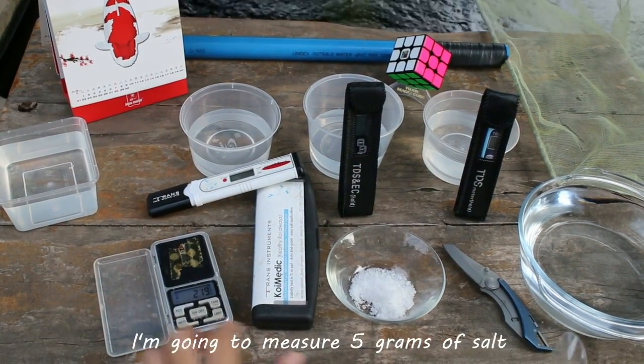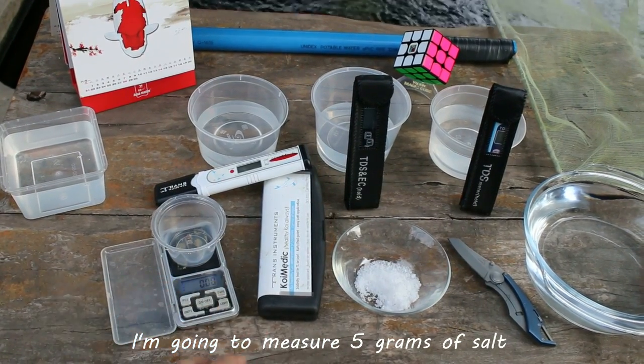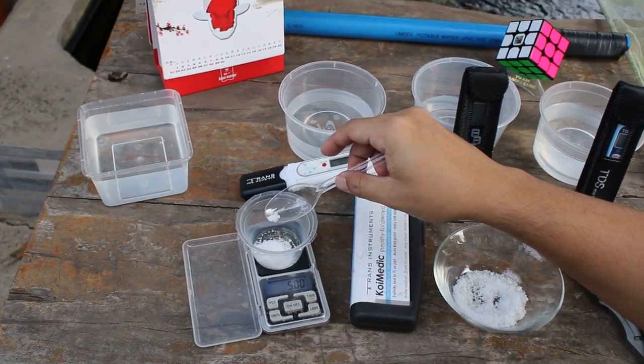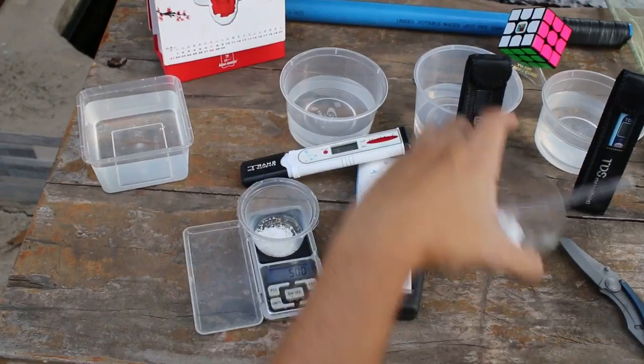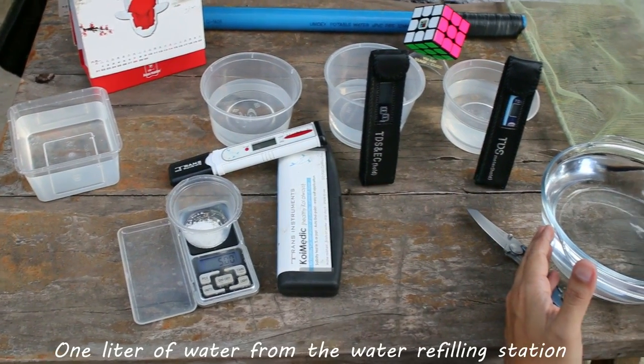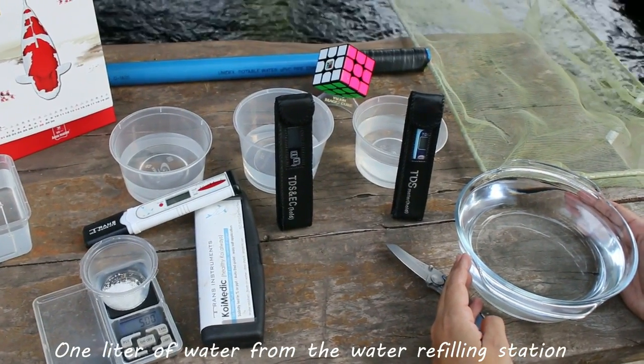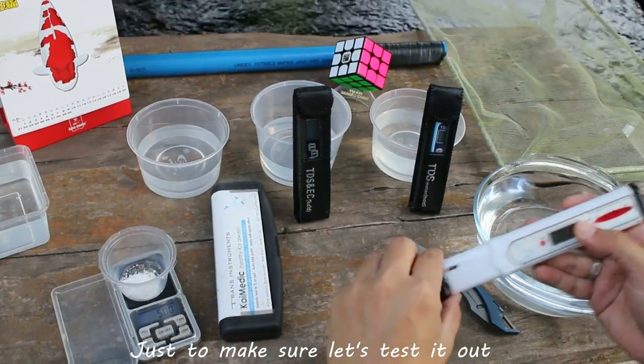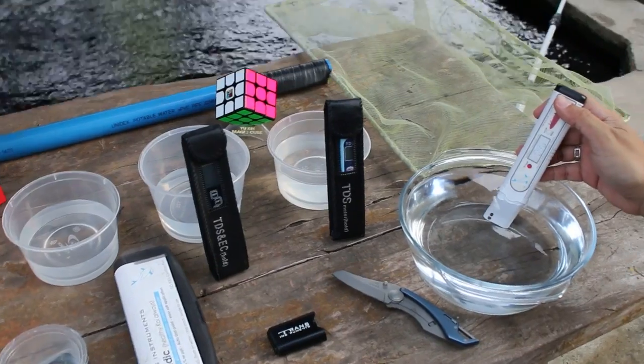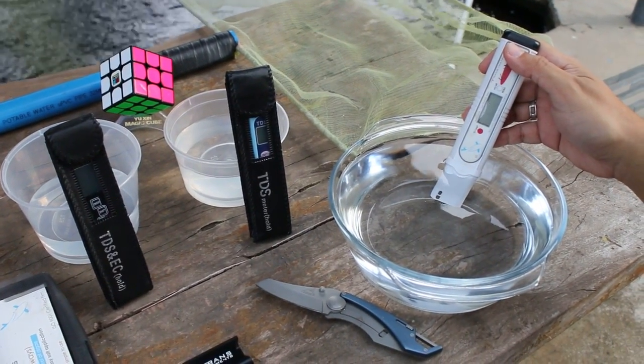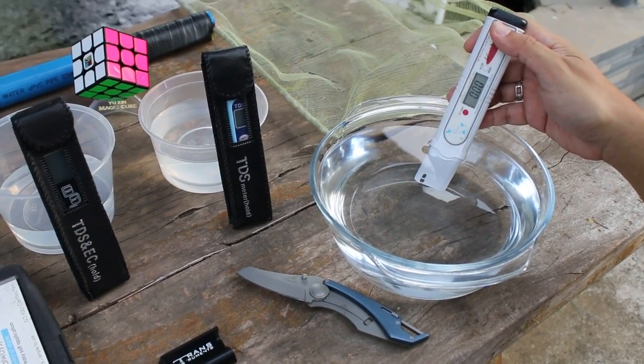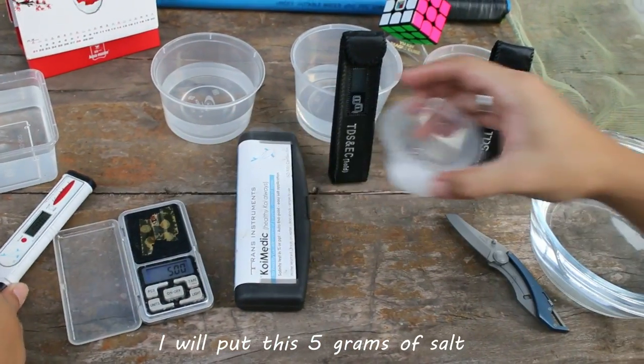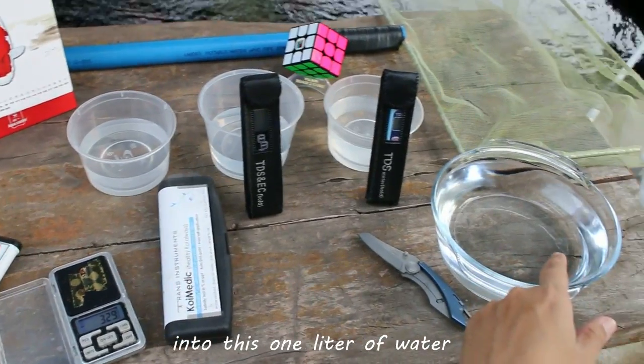Here we go, I'm going to measure five grams of salt. Yes, that's it, five grams. Here on my right is one liter of water from a refilling station. This has zero salting. Zero, right. Let's wait for the beep. There you go, there's that beep. So going back, I will put this five grams of salt into this one liter of water.